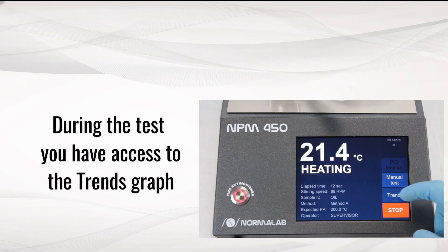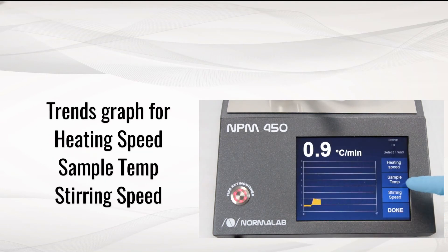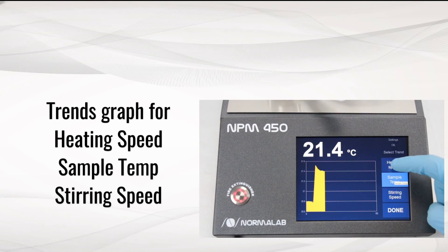You can follow the heating speed, the sample temperature, and the stirring speed.